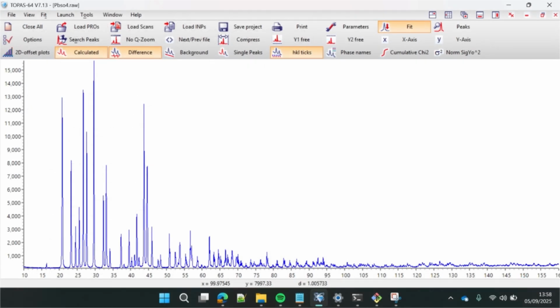So here is the XRD pattern for lead sulphate, and the first step in any refinement is to fit a background function. You can see from the background on the scan it is flat, no humps or rises. This would be good to fit with a Chebyshev polynomial, a low order polynomial, but I will show you a different method which can be good for more experimental data.